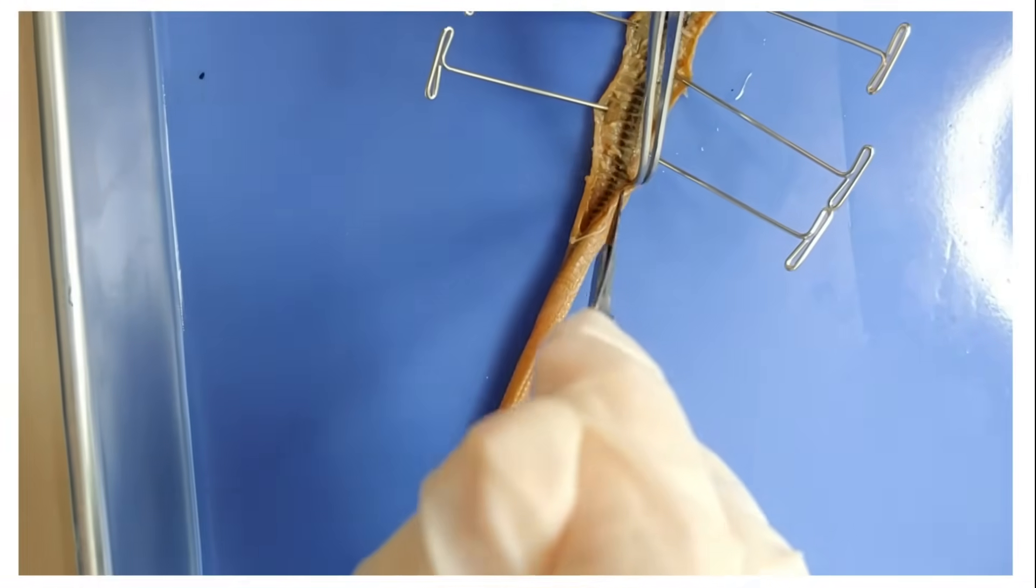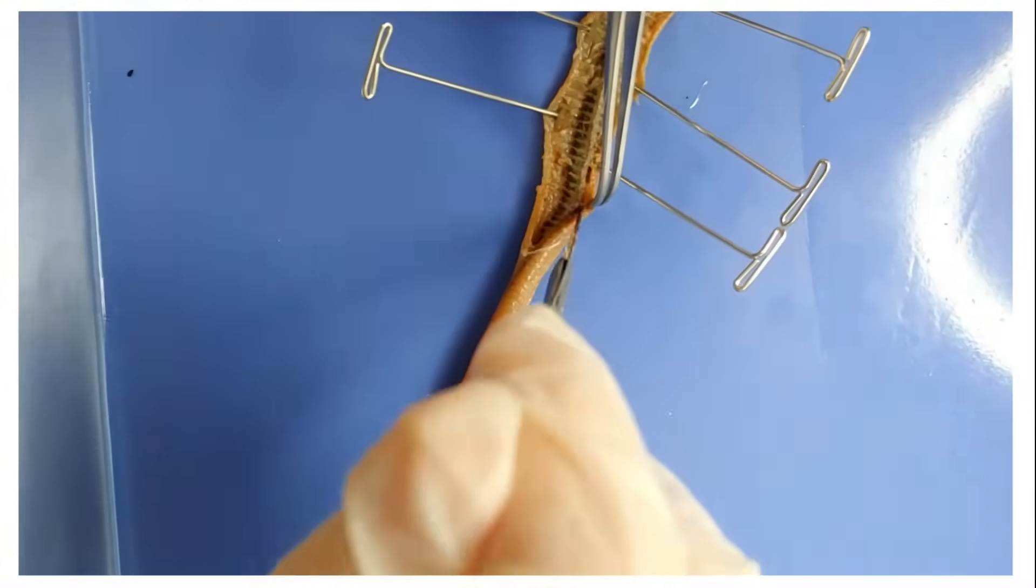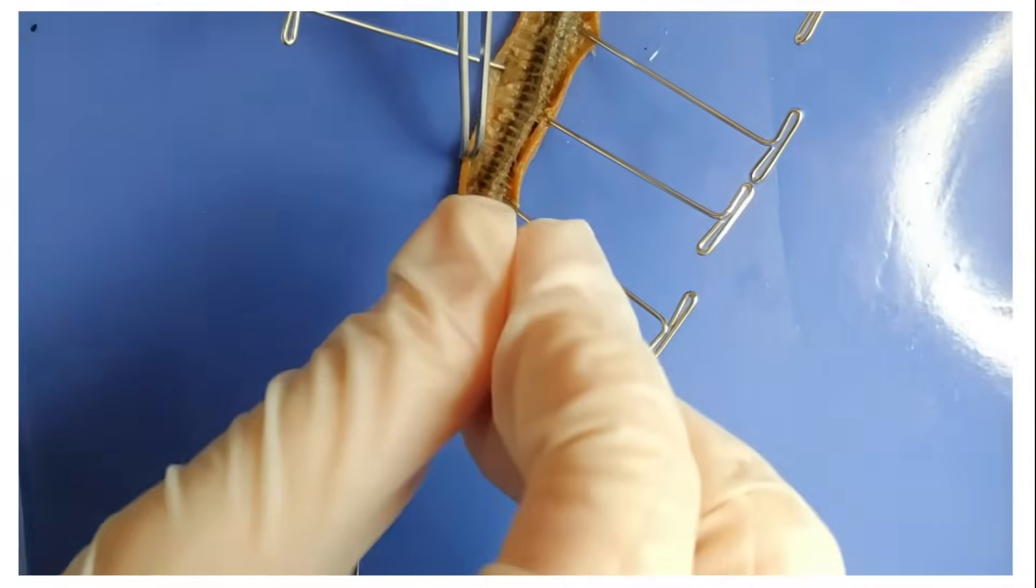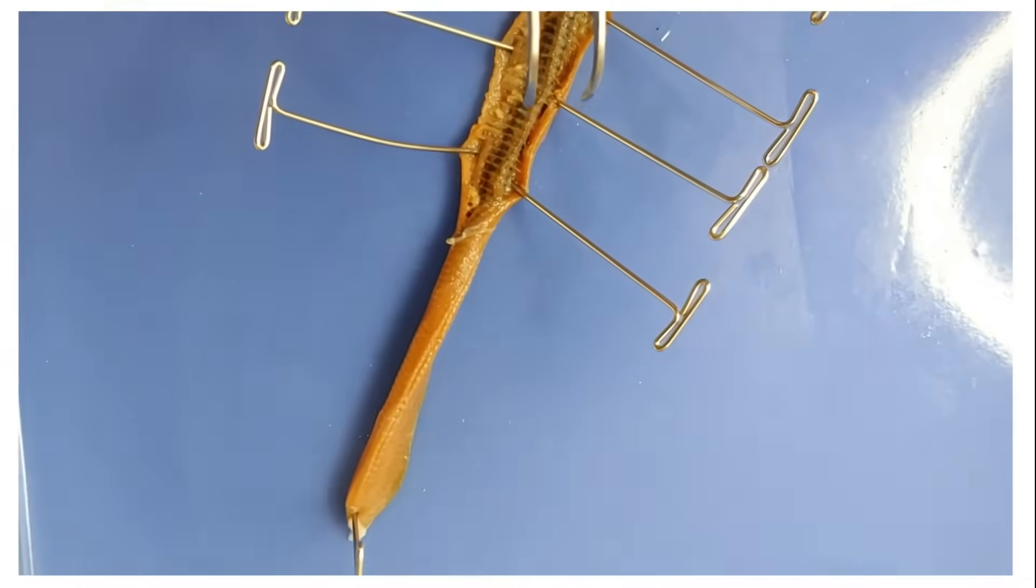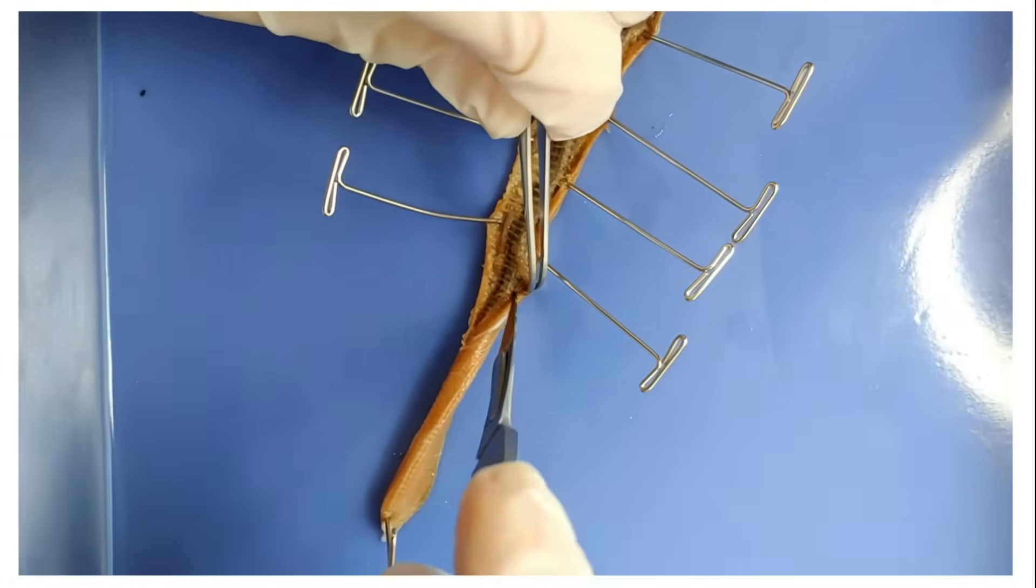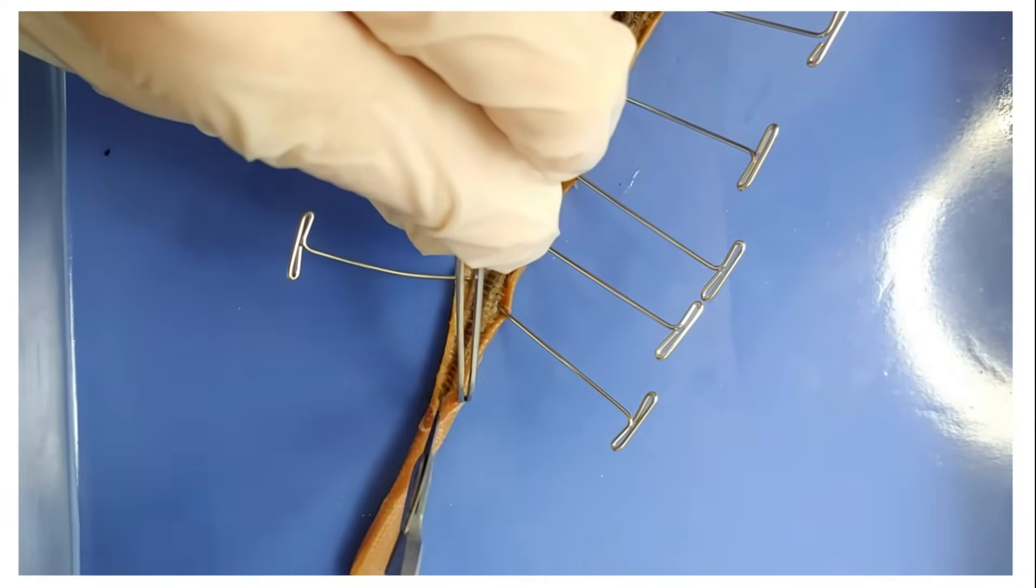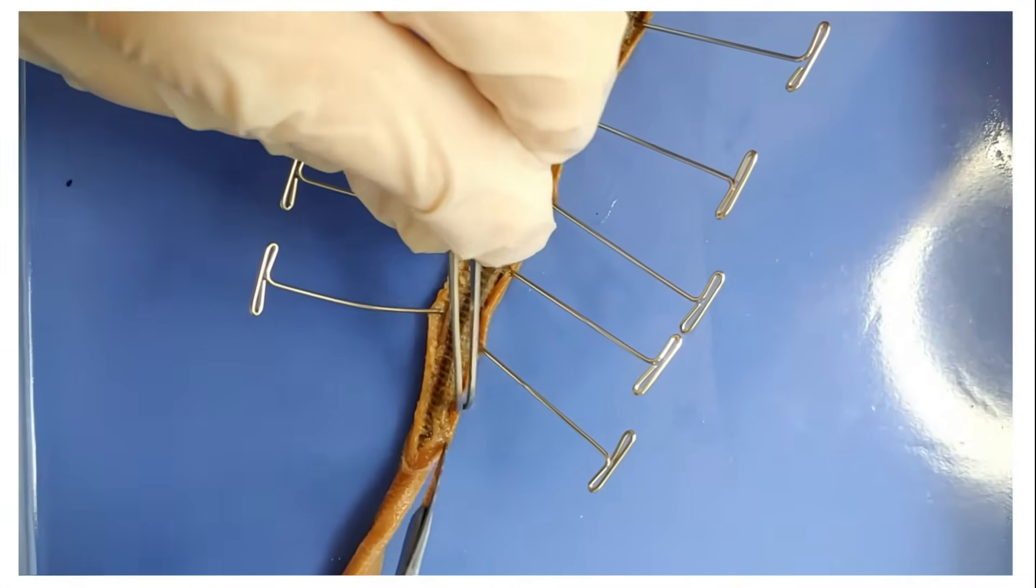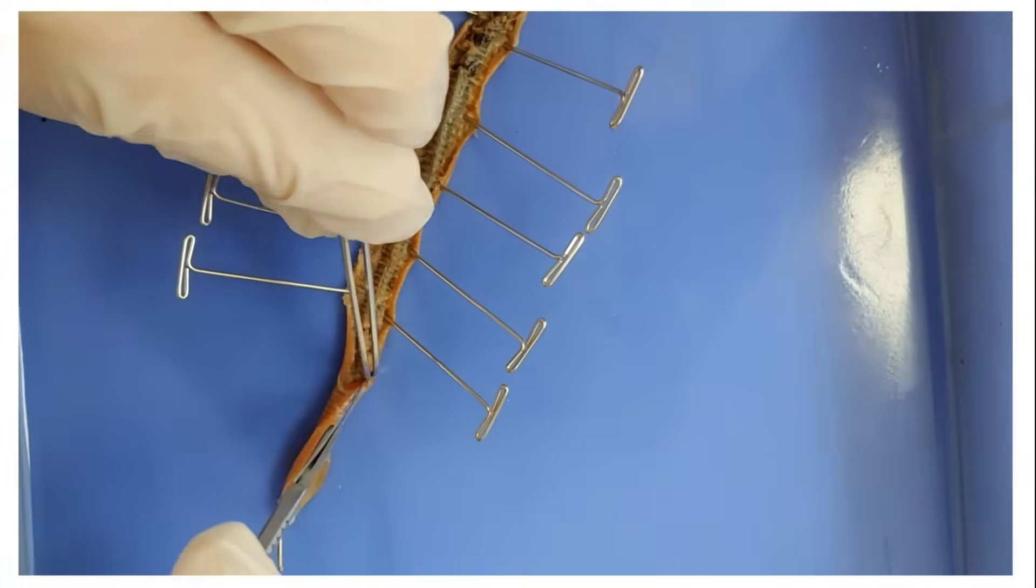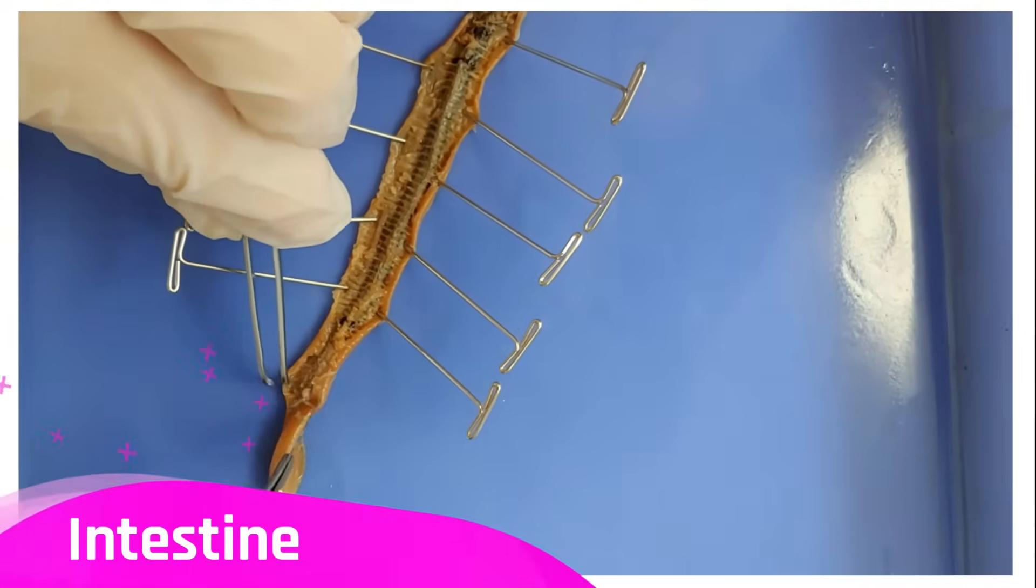A worm is an interesting animal to dissect because it's basically a tube within a tube. This can teach us a lot because you are also a tube within a tube. You have your digestive tract which is your inner tube and everything else around it which is the outer tube. Now what I have revealed so far is the worm's intestine.